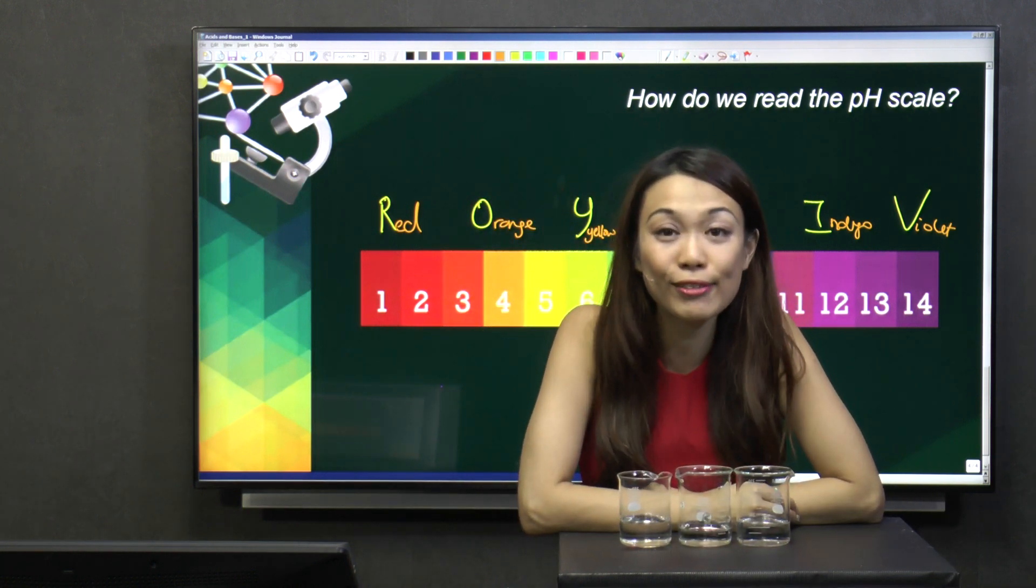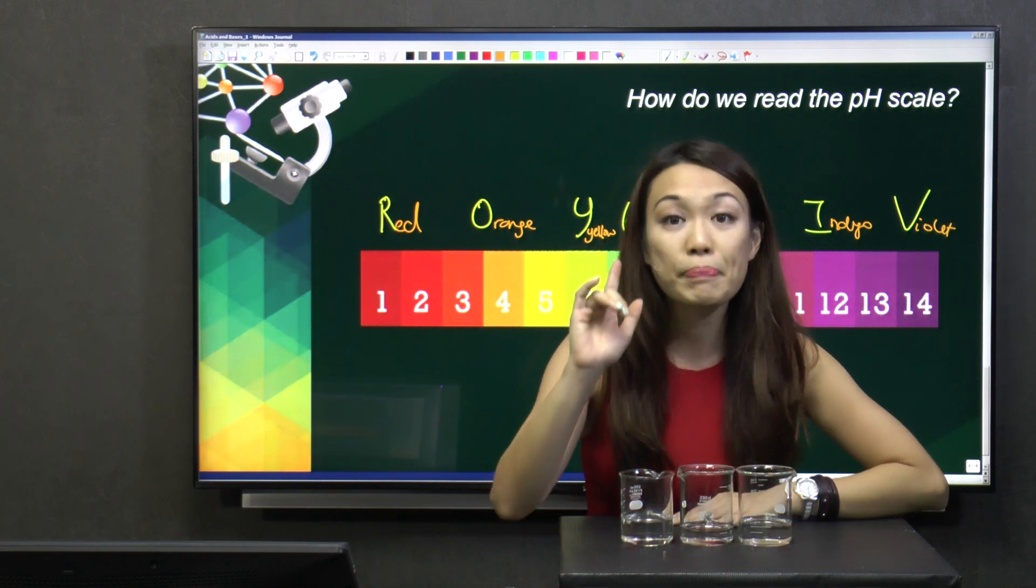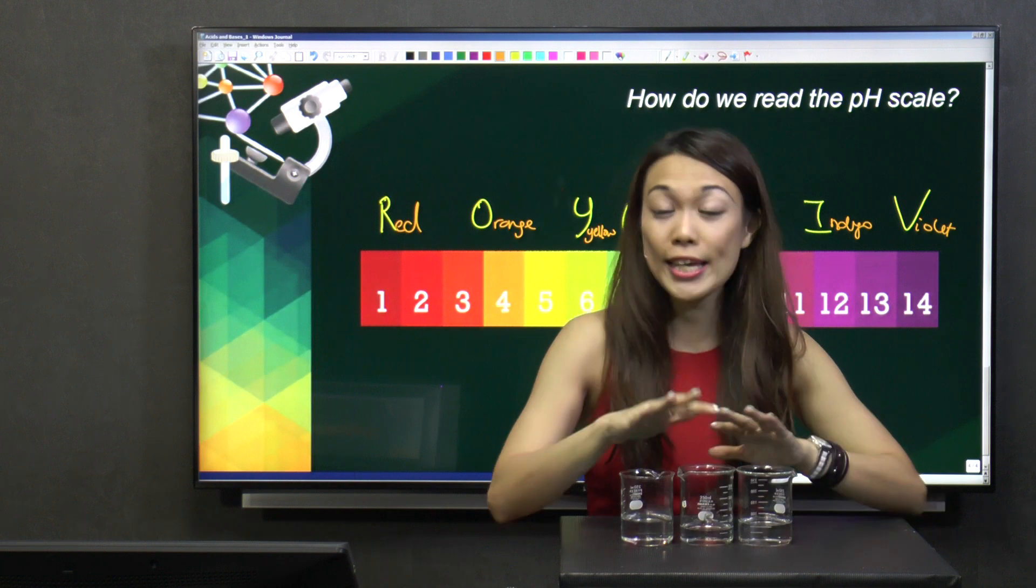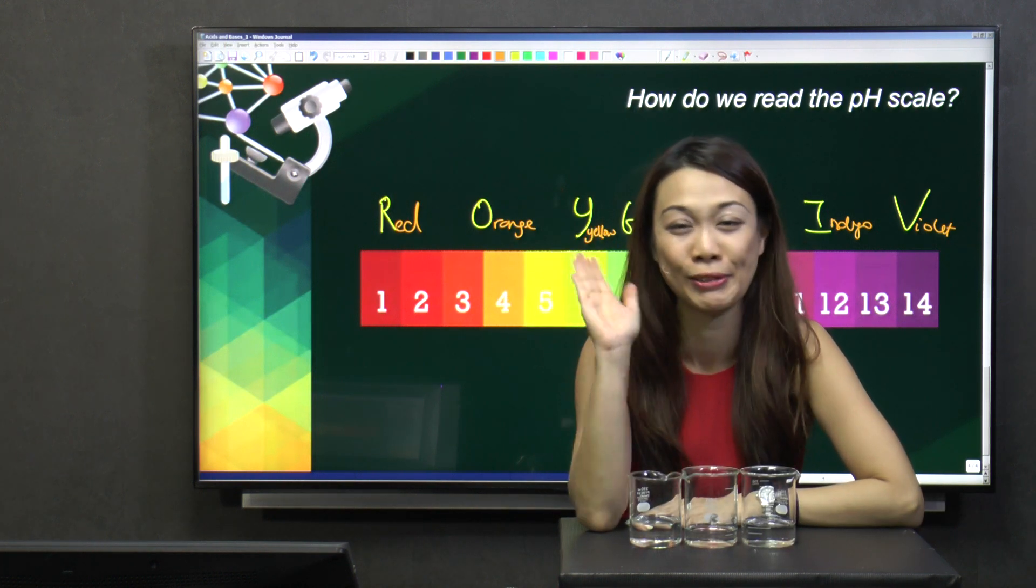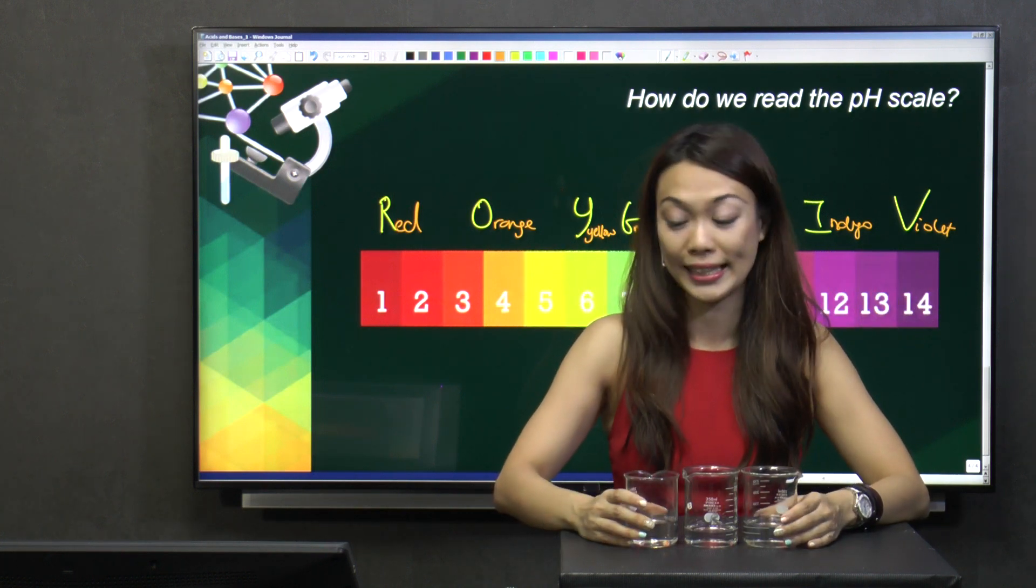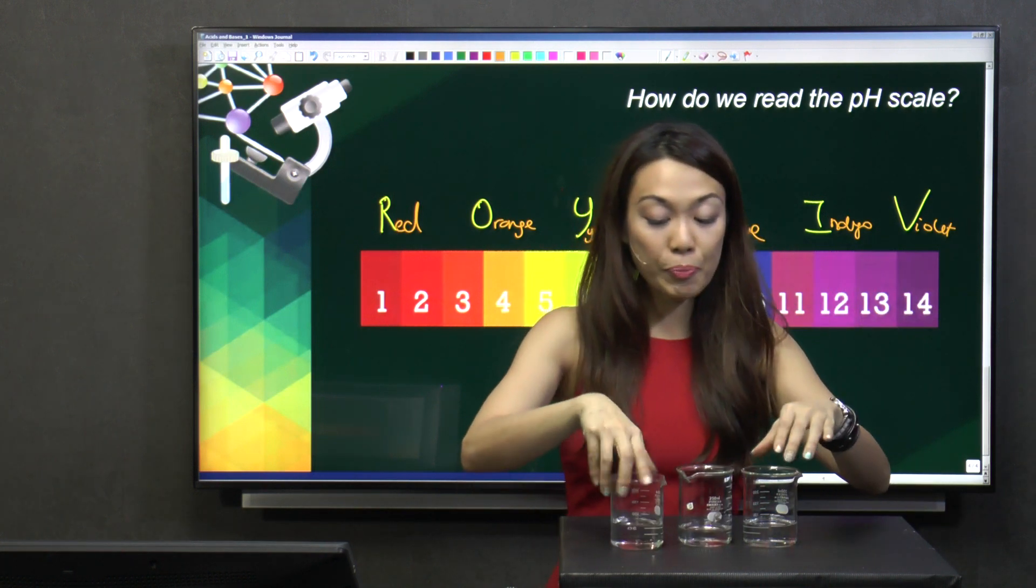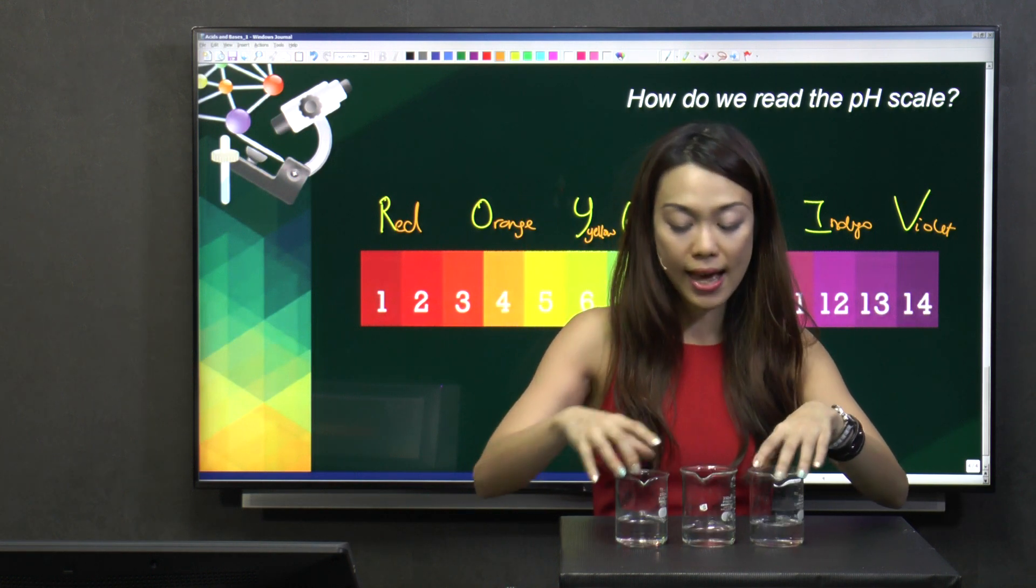As you see over here, does it look like just plain water? Wow, I can just take it and drink, right? Please, pause. In any cases, your friend hand you anything in the lab to drink, please do not do that. Especially if they place it in a beaker like this. Why? It could be acid, it could be water, and it could be an alkaline. You never know.